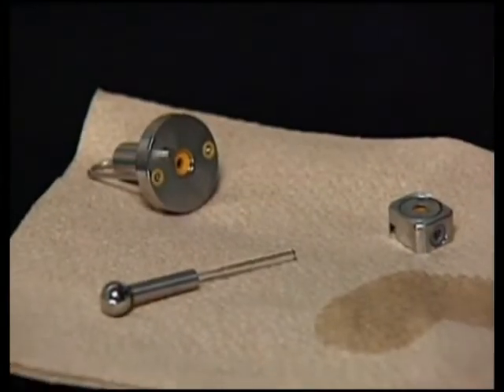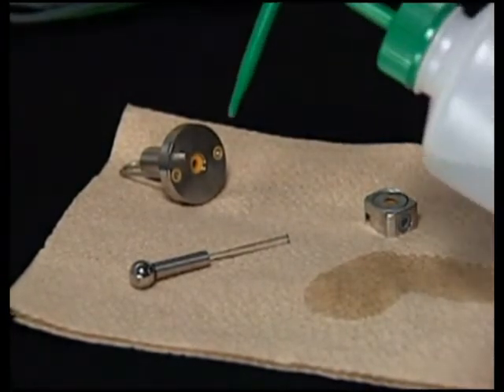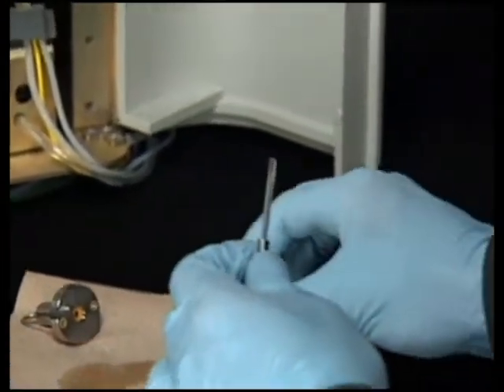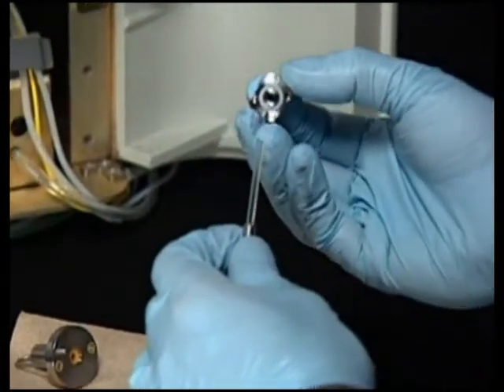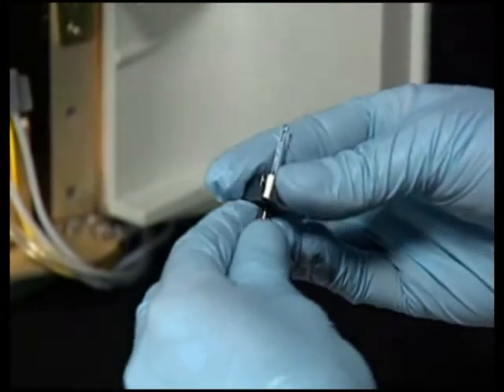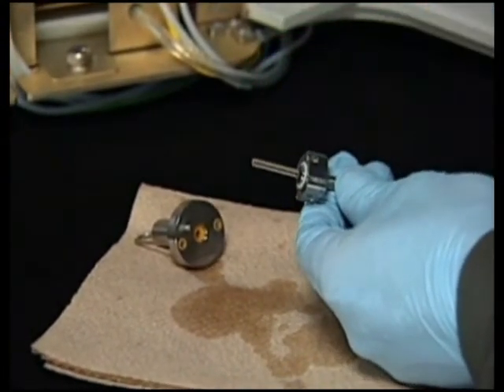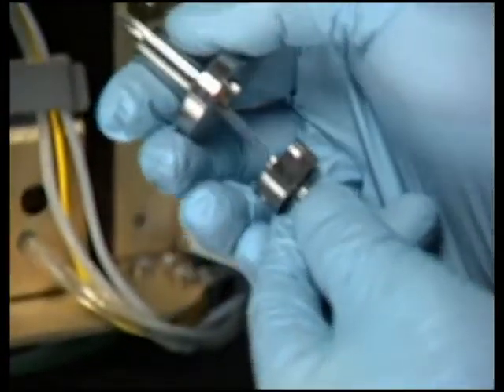Once all the seals have been replaced and the plunger is clean, you are ready to reassemble the head. Wet the plunger and inside cavity of the seal wash thoroughly with methanol. Slide the seal wash assembly onto the plunger, making sure the face seal is toward the front end of the plunger. Wet the plunger and inside cavity of the head thoroughly with methanol, then slide the head onto the plunger, aligning the head pin into the seal wash.